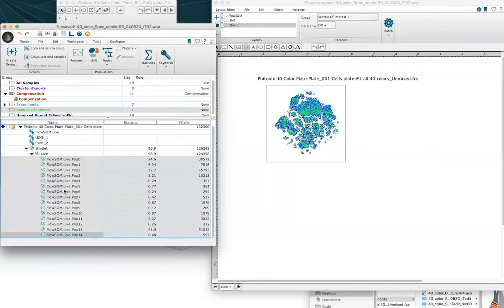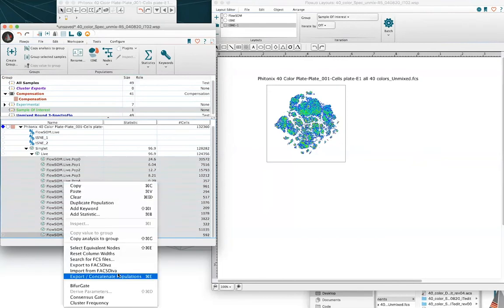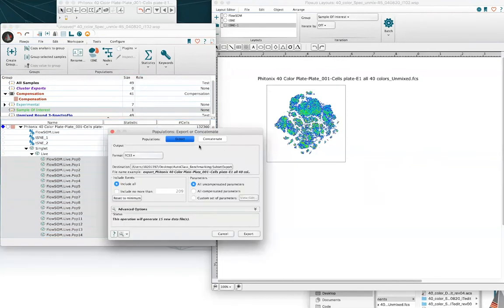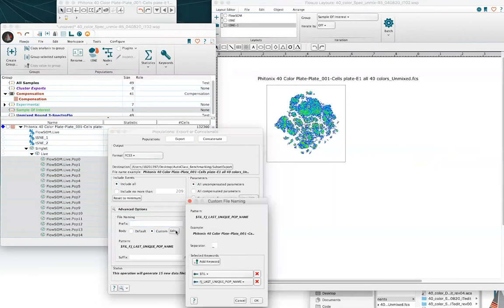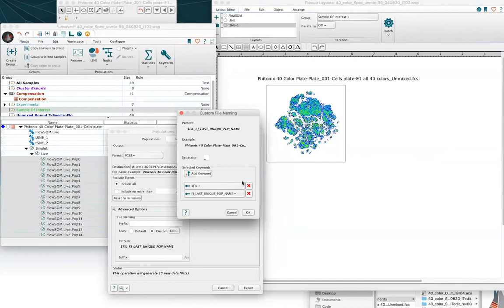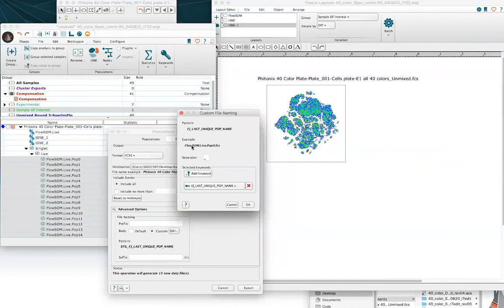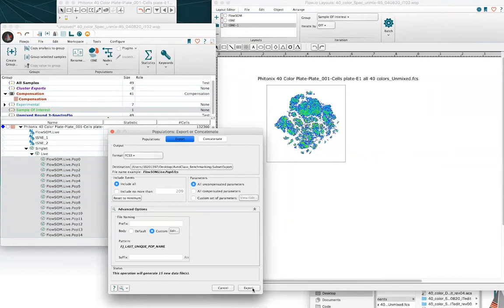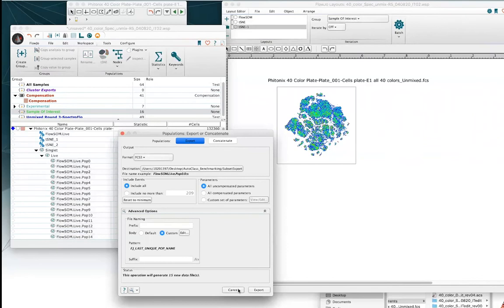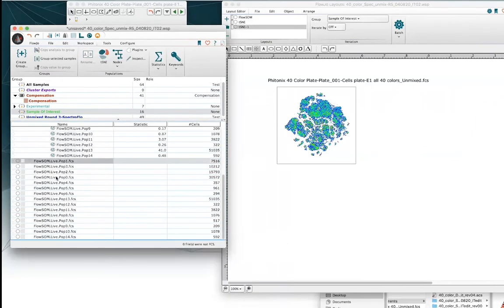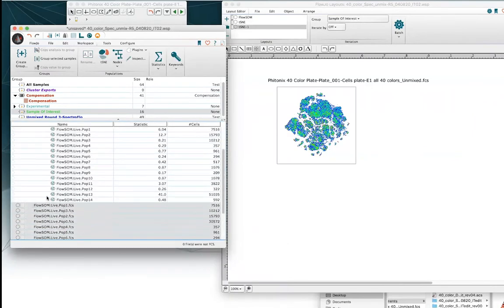Selecting all of these populations, I can right-click, choose export concatenate, and go ahead and perform an export. I just like to remove the beginning of the name of our export and also change the name so that we're only looking at the last unique population name, which will tell us which cluster we've actually selected. Then open that in the existing workspace.